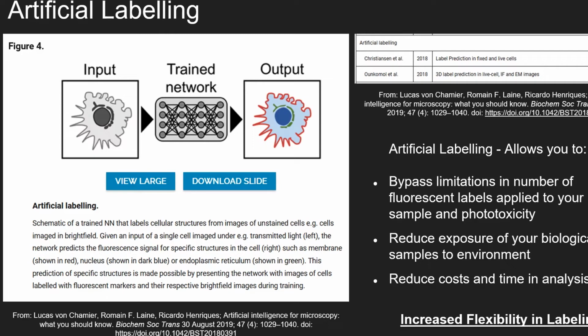your samples have from moving from your outer lab environment to your incubator and back and forth. But all of this is contextual depending on exactly what you're doing. So for some people, this may not apply, but I love the idea to artificially label.